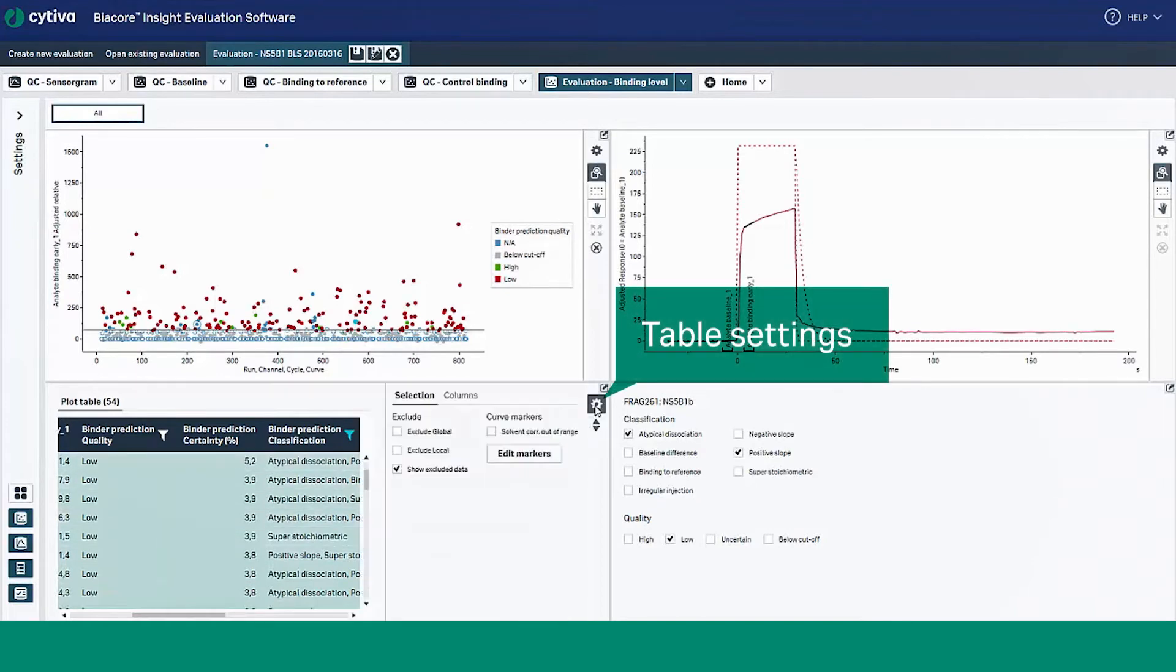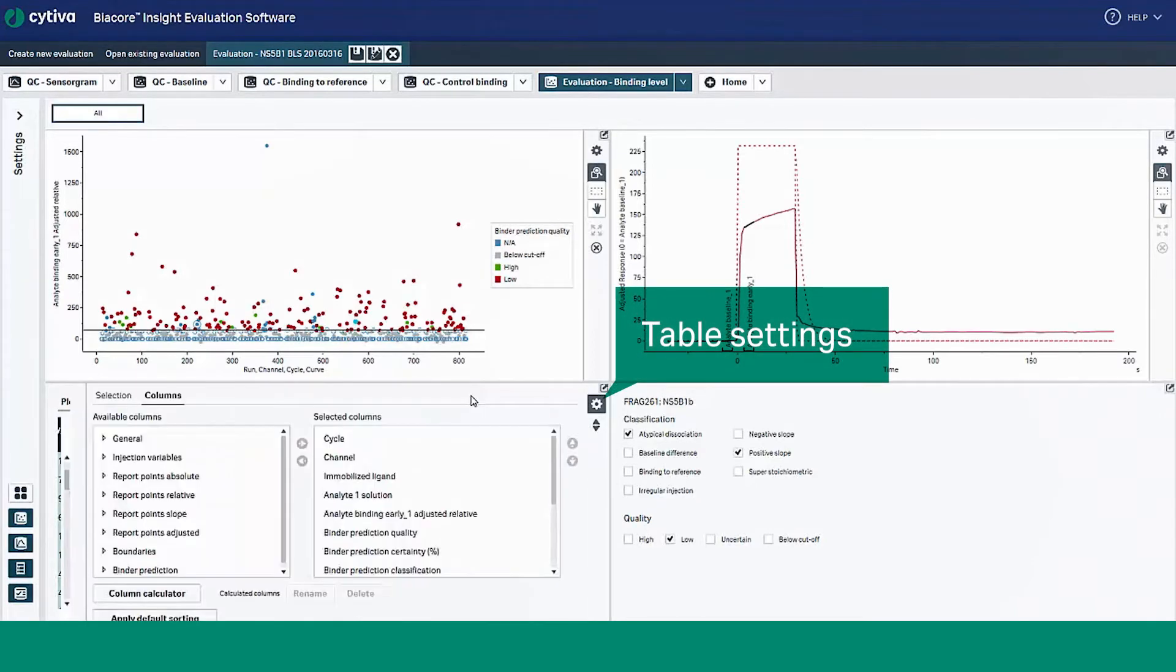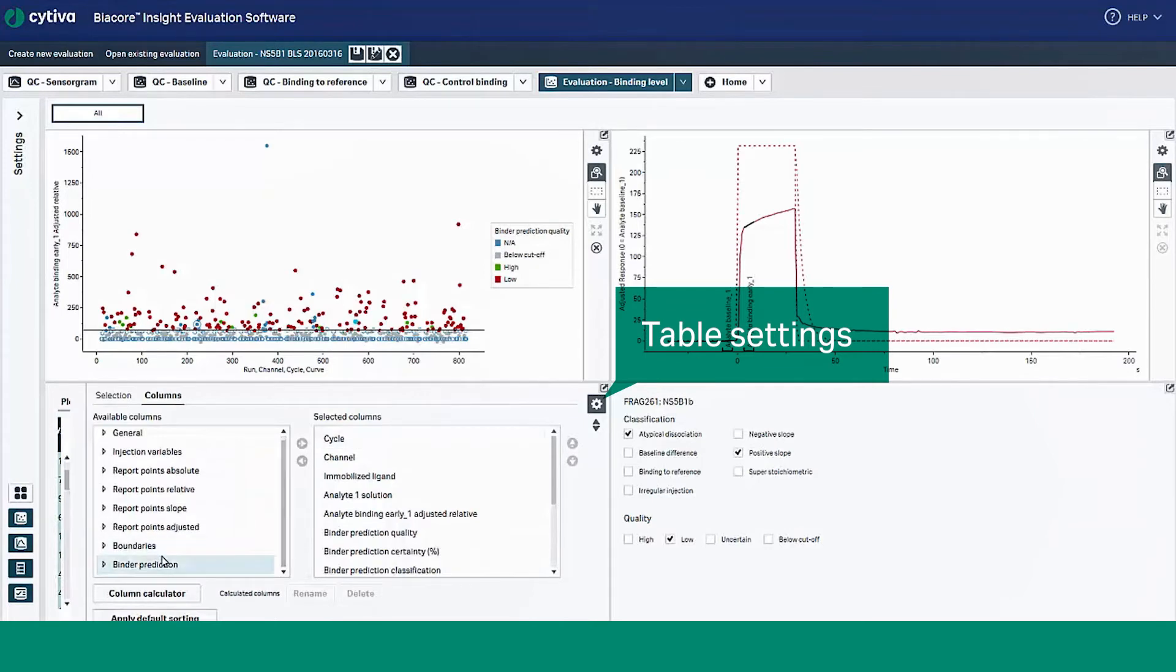You can customize the view of the plot table by choosing the columns you want to include. Select the columns option under table settings to make your selection.